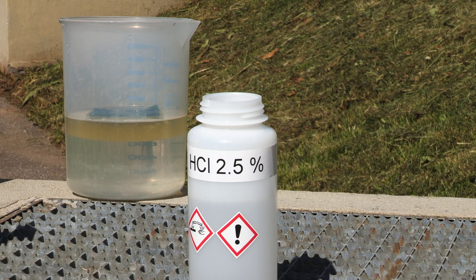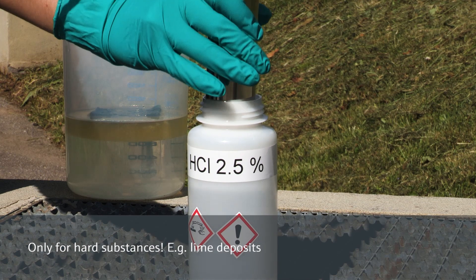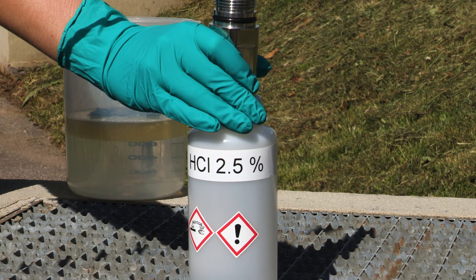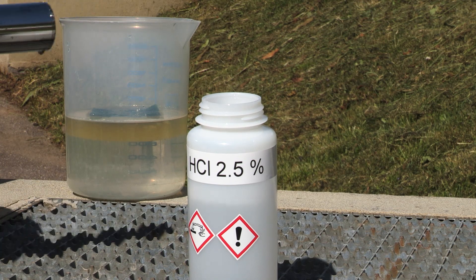For substances which cannot be removed by water alone, like lime scaling, immerse the sensor in a 1–5% hydrochloric acid solution for about 2 minutes. But be careful to avoid contact with your skin or eyes.